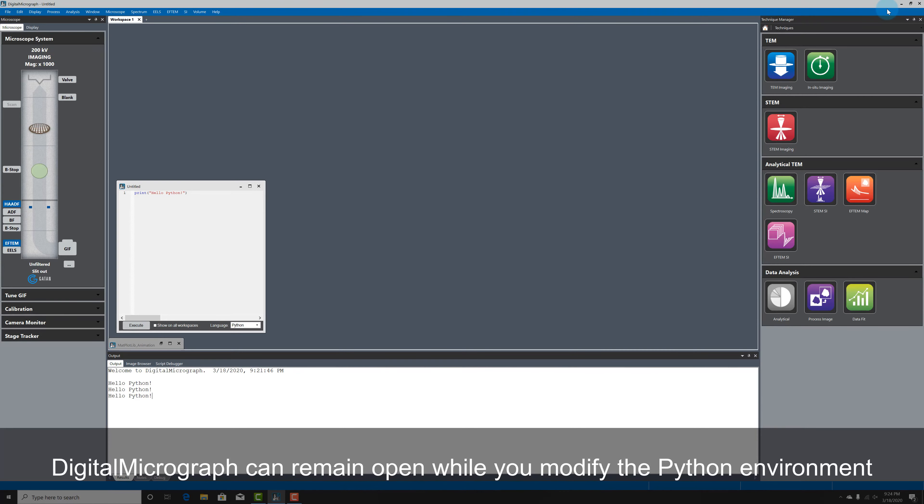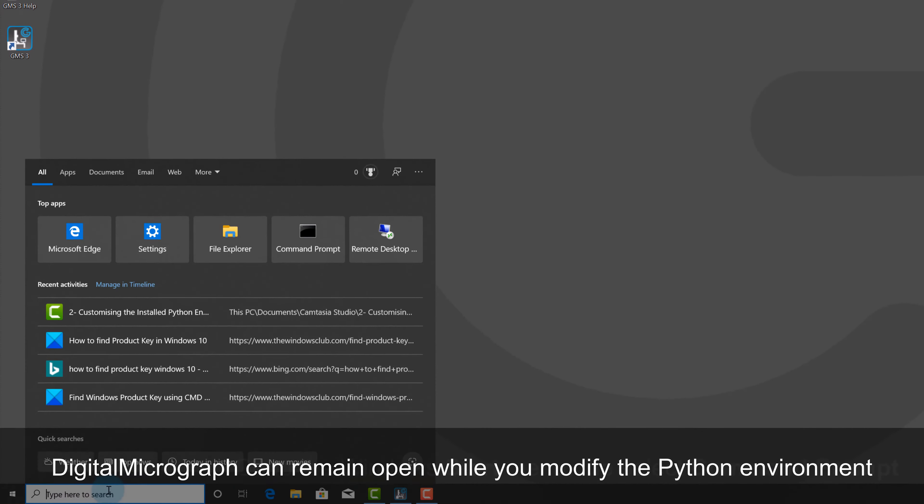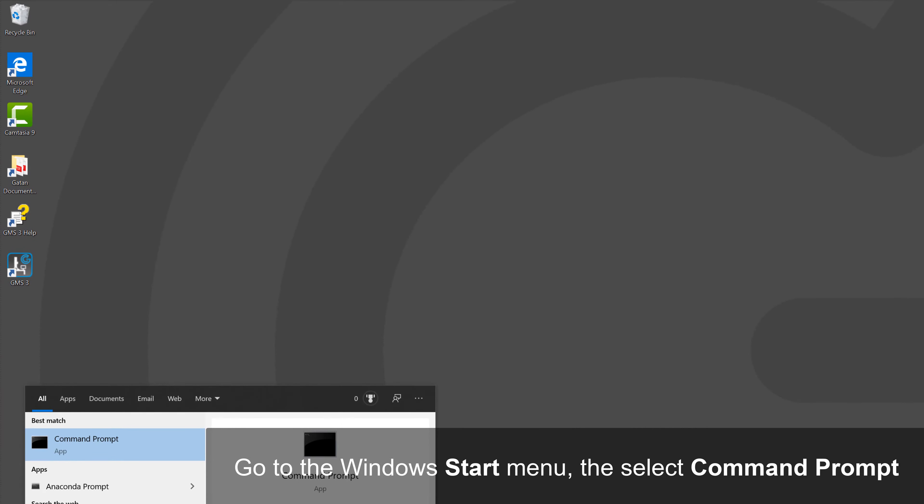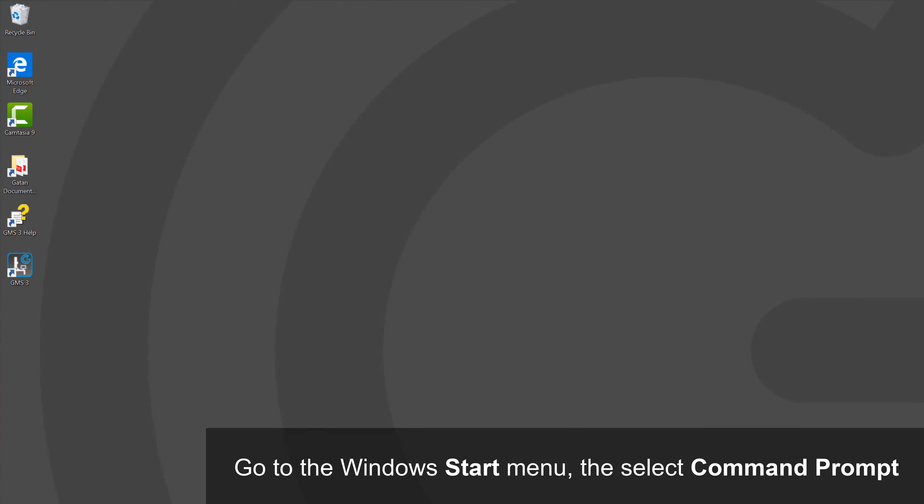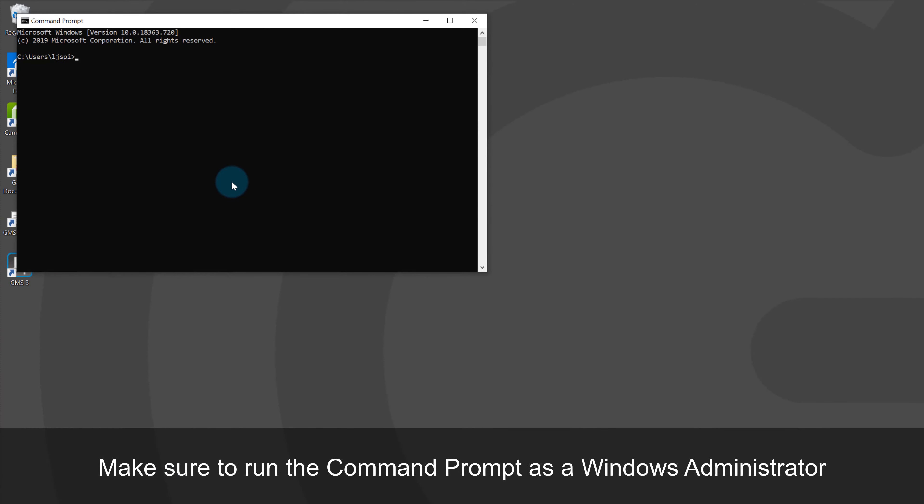Digital Micrograph can remain open while the Python environment is modified, but it's helpful to minimize the application to create some screen space. Open a Windows command prompt and make sure to run as an admin.